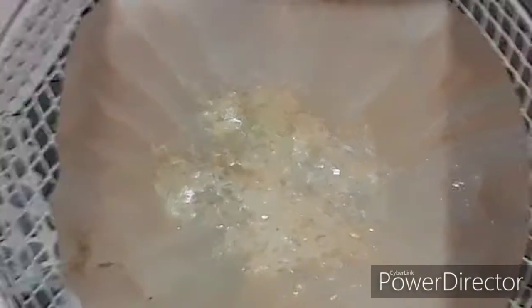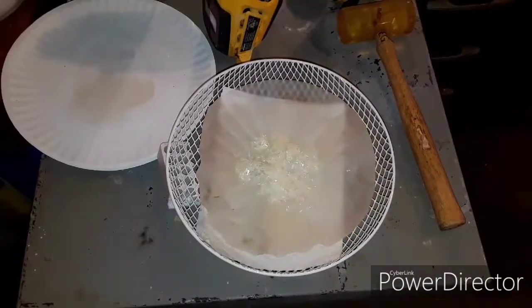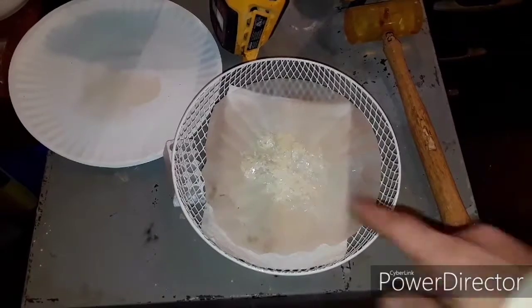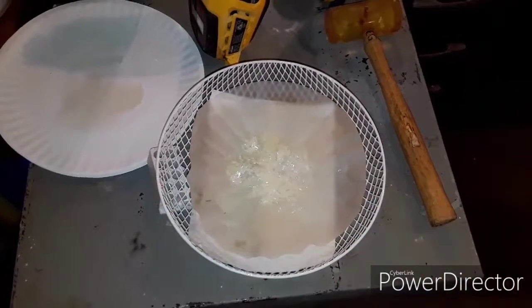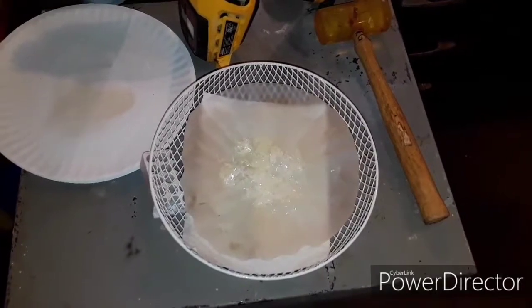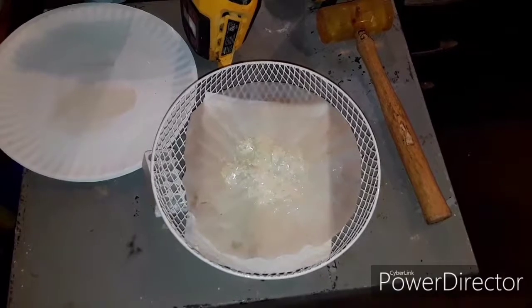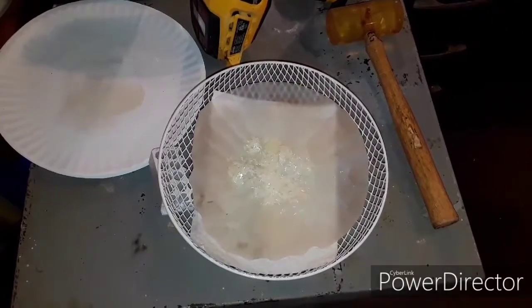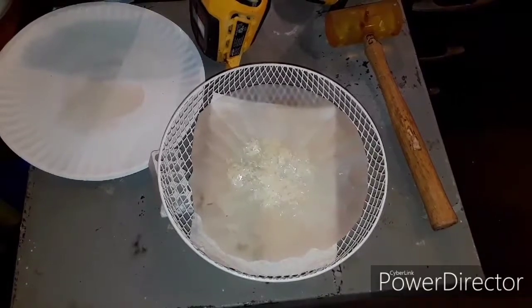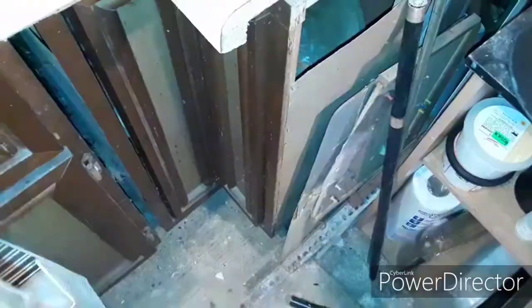And I am expecting there to be a lot more crystals this time than there were on this batch here, and that is because I actually have left it in the freezer for a full 12 hours this time, thus allowing the crystals to precipitate for a lot longer. So let me get it out of my lab freezer and we'll see what we got.